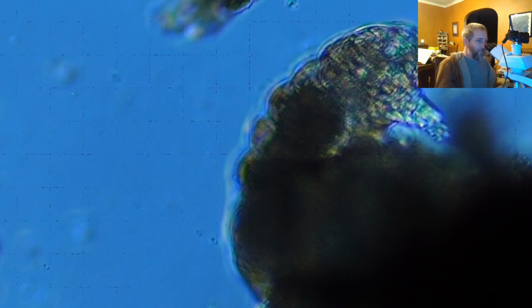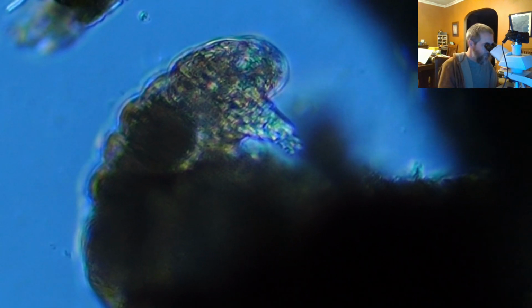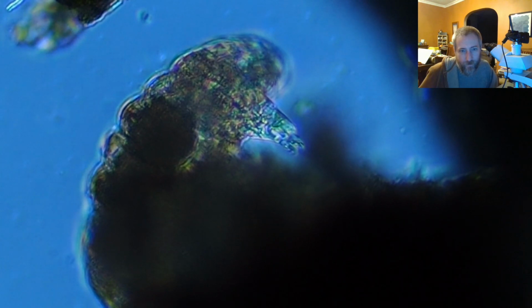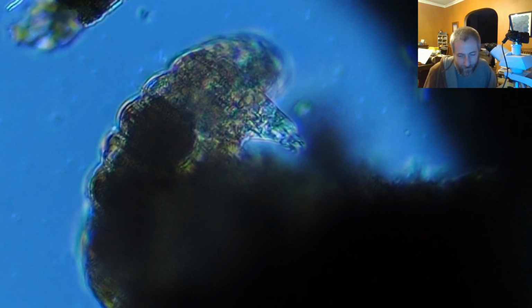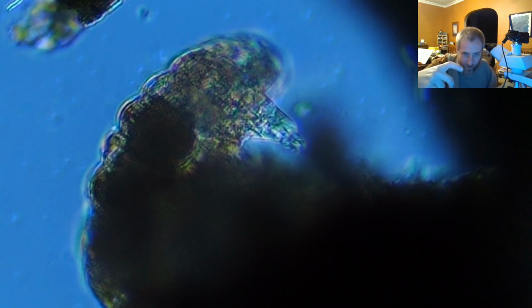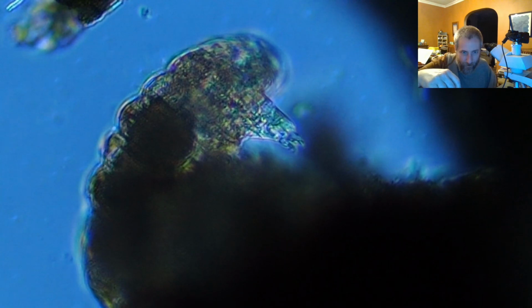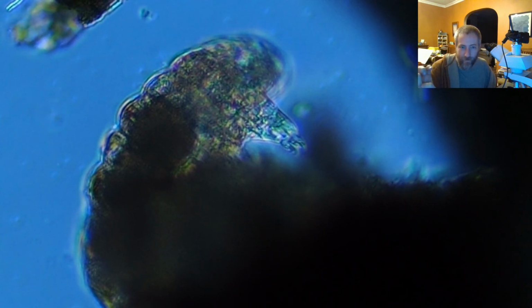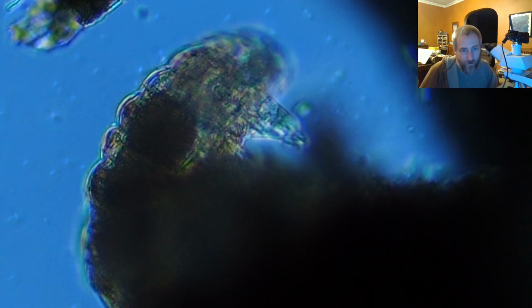Because this guy really isn't moving very much, we can zoom in quite a bit and take a look at him. Stuck next to my giant melon over here, but you can really see the claws on the end of the feet right there, very readily. If you look at the claws, you can see that there are two sets of claws curled around at the bottom of its foot, and then a separate set of two claws that are kind of curled around, and they have a sort of thumb for each one of those, so they can grasp stuff and articulate them a little bit.